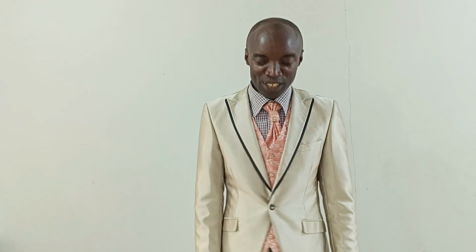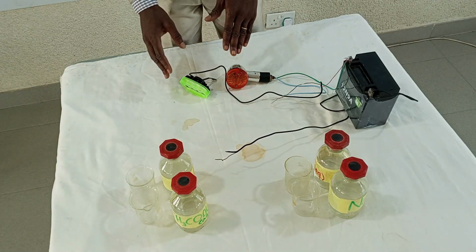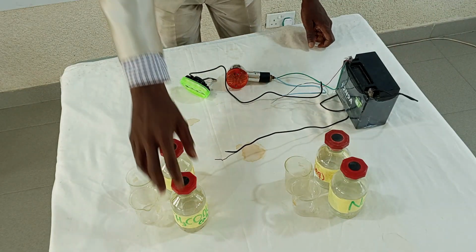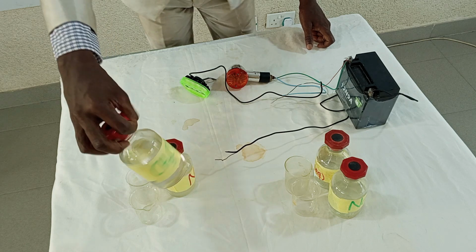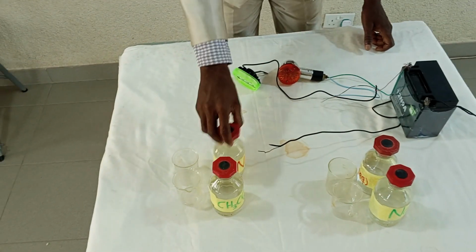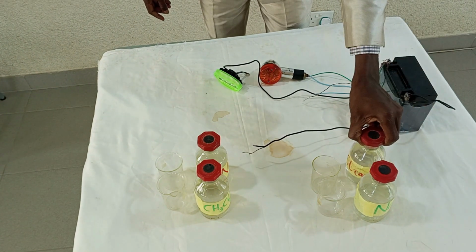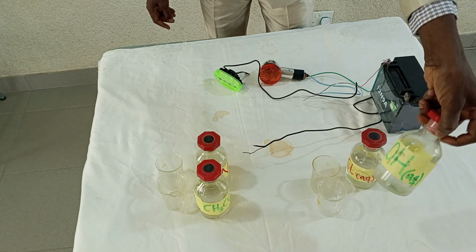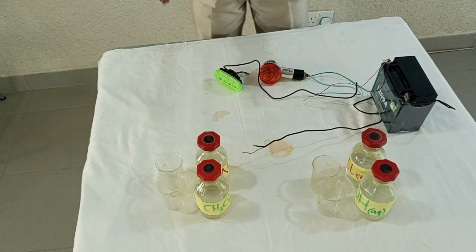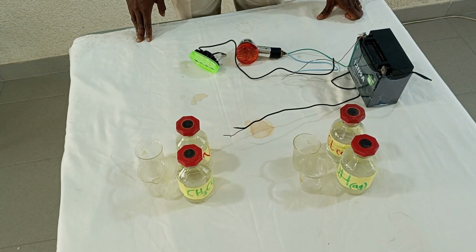Hello, permit me to demonstrate to you the conductivity of ions in solution. Here I have a battery and a lamp that I've connected. I also have a weak acid, which is ethanoic acid, a weak base, which is ammonia, a strong acid, which is HCl, and a strong base, which is sodium hydroxide. In this lesson, I'm going to demonstrate which of them can conduct electricity.